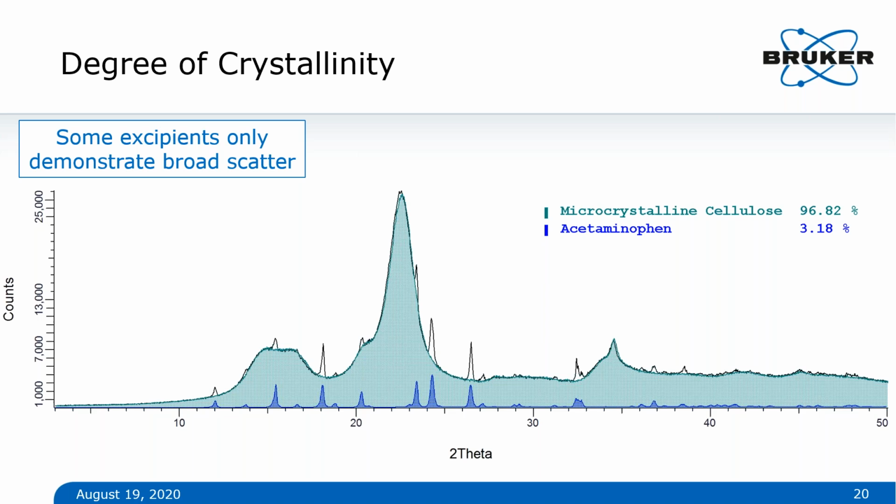Well, so if it's there, it's there. Unfortunately, anything that you put in the sample holder or basically in between the X-ray tube and your detector is going to give you signal. So if you were looking at a formulation and there is a lot of microcrystalline cellulose in there, or any excipient for that matter, whether it be like lactose or mannitol or any of the other polysaccharides, you'll see it. And unfortunately, it's not so simple as you can't direct the X-ray to avoid the sample if it's in the sample holder.